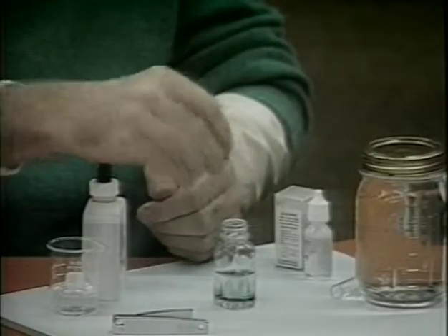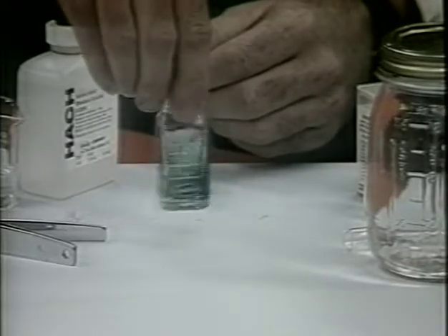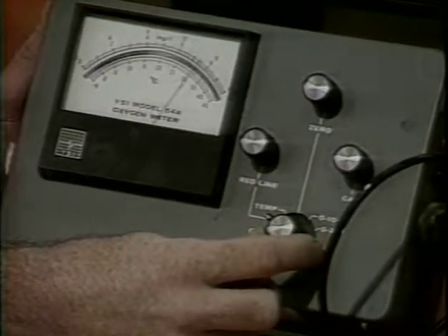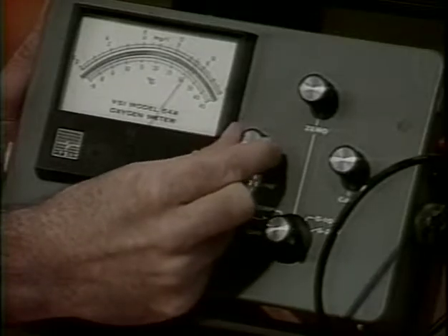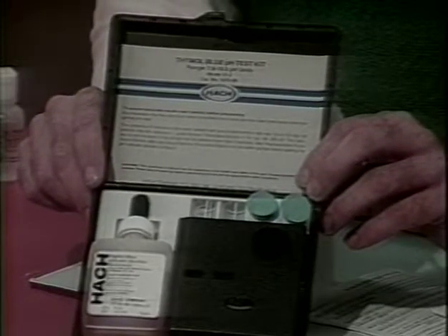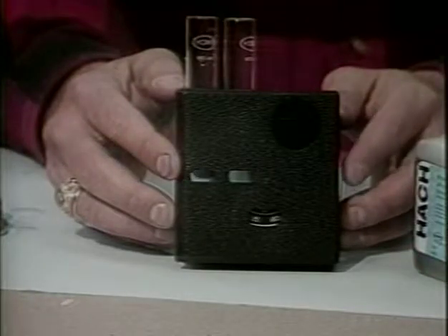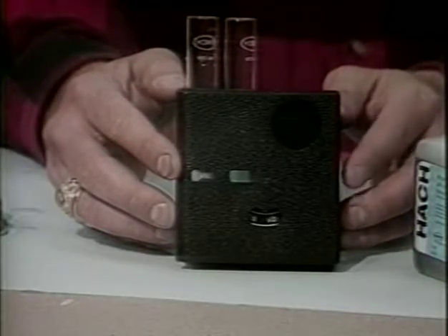Testing procedures and corrective measures concerning total alkalinity and hardness were presented in tape 1 of this series. Throughout this video, water testing equipment such as kits and meters will be shown. Testing examples will employ a specific kit or meter simply for convenience. The producer of this video series does not endorse any of the particular kits or meters. Keep in mind that other kits and meters are available and procedures may differ slightly from the examples shown in this video. There are several methods to measure the abundance of phytoplankton.